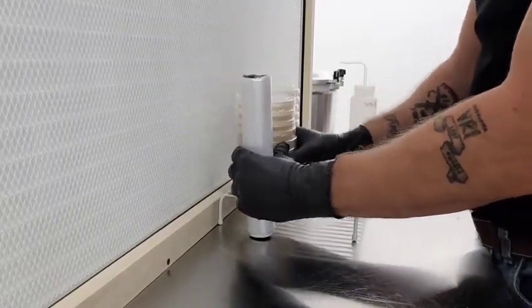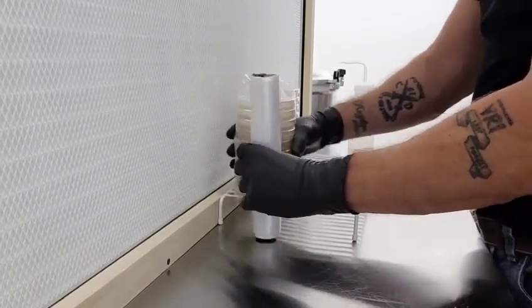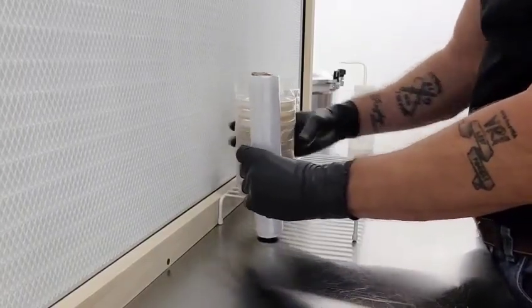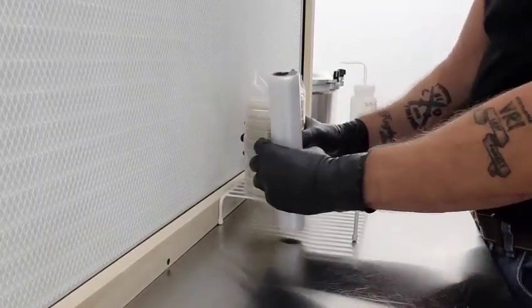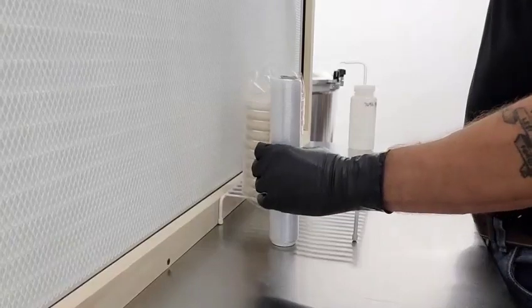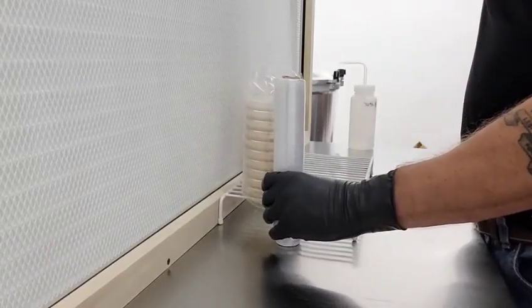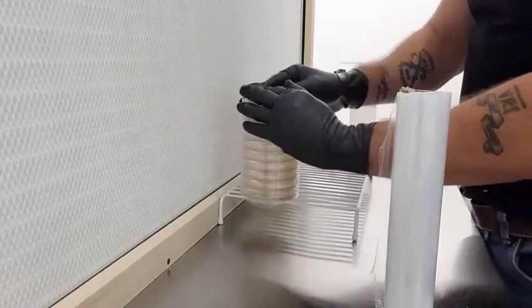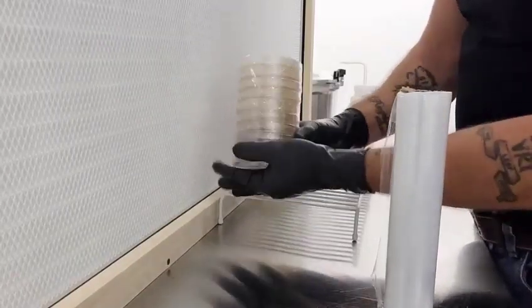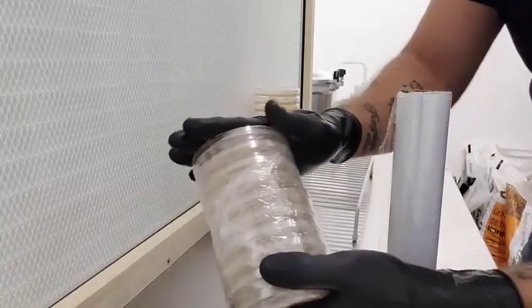Keep the Saran taut as you spin. There you go. Pull down the top, pull it under the bottom, and as you can see, it's wrapped up nicely for future use.